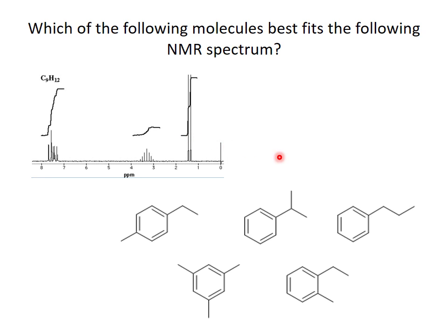This was a pretty hard spectrum for you to do as a first try in interpreting spectra. But what does this point to? This points to monosubstitution, and it points to an isopropyl group. So this is the correct compound.